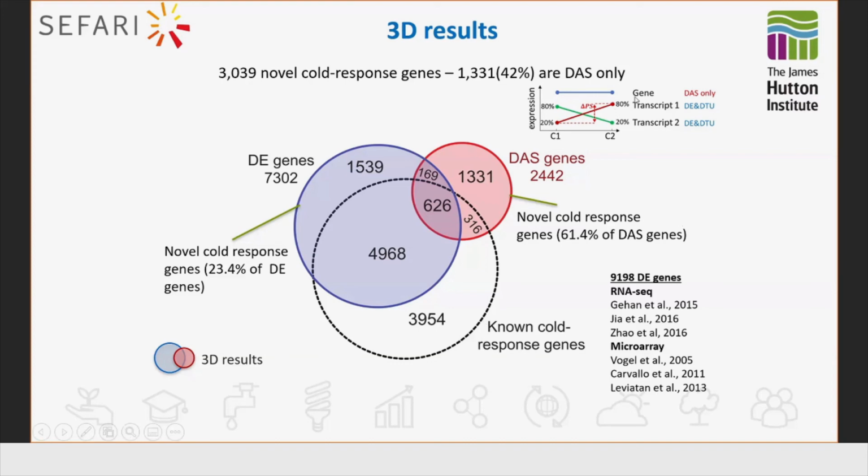And then, so here is just showing some numbers. So that means our 3D pipeline is actually very good to do that.